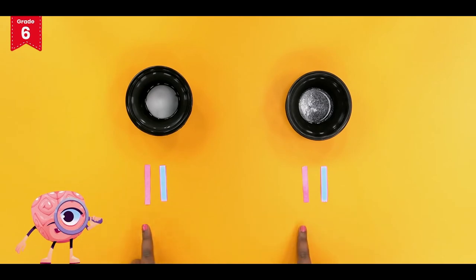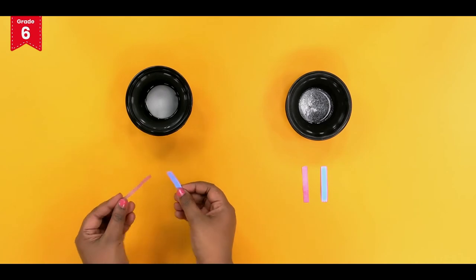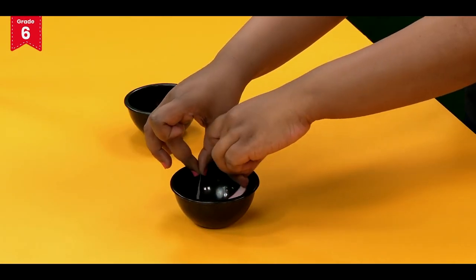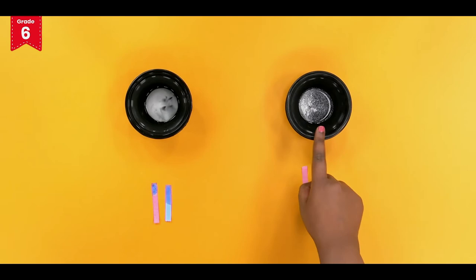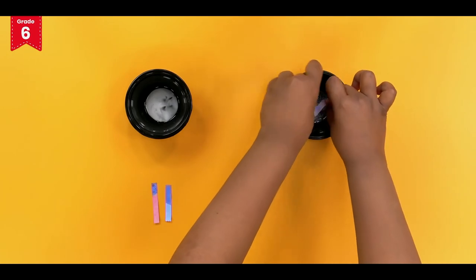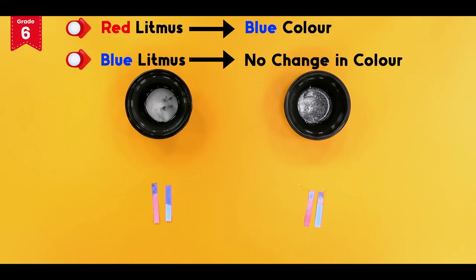Now dip 1 red and blue litmus strip one by one in each of the bowls containing baking soda solution and detergent solution. Dip 1 red and blue litmus strip. Keep it aside. Repeat the same for the bowl containing detergent solution. Keep it aside. Baking soda solution and detergent solution change the color of red litmus to blue, but there is no color change in blue litmus.